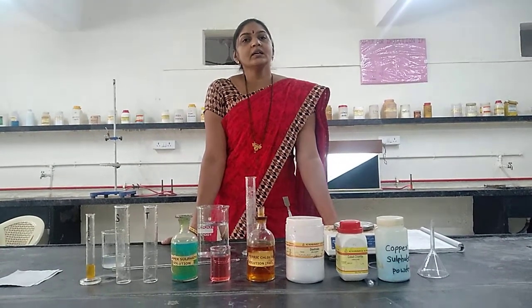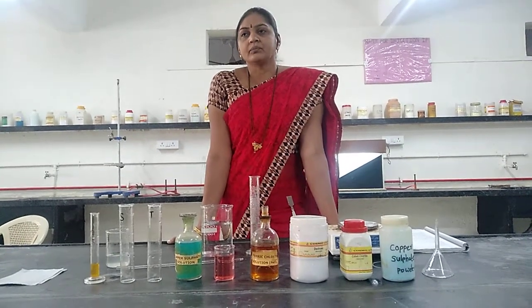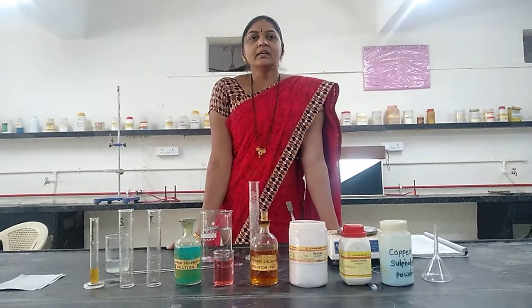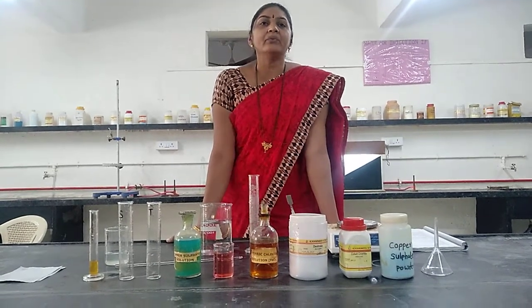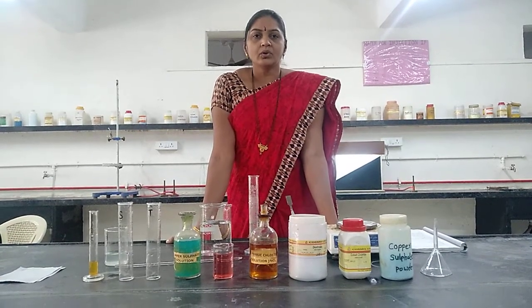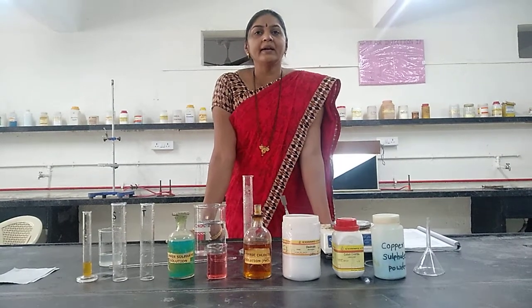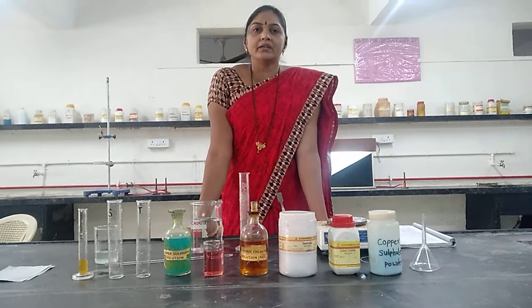So today we have to see suitability of dextrose for parenteral solution. When dextrose is taken and water is added, it gets dissolved. It doesn't show any color, that is, it is colorless. It is compared with the standard solution that is prescribed in IP. So today we will prepare standard solution and sample solution. Our sample is dextrose. When dextrose anhydrous is dissolved in water, it will show a colorless solution.